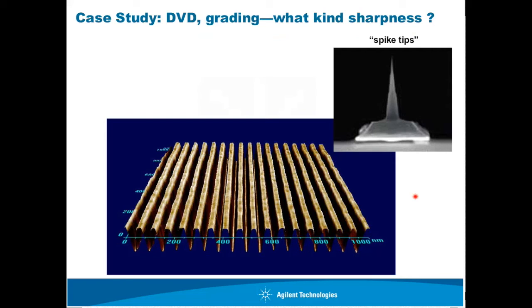That's because the lateral attractive force between the sidewall of the tip and the sidewall of the grating causes the amplitude to drop a lot, and therefore you have to reduce your set point a lot in order for the tip to reach the bottom. But when you do that, you also blunt your tip. Someone gave me 10 of these samples and I wasted 10 tips. Every time, at the end of the imaging, you do reach the bottom of the gratings, but you also completely blunt your tip, and this tip is useless for the next sample. So this is a difficult question for me.